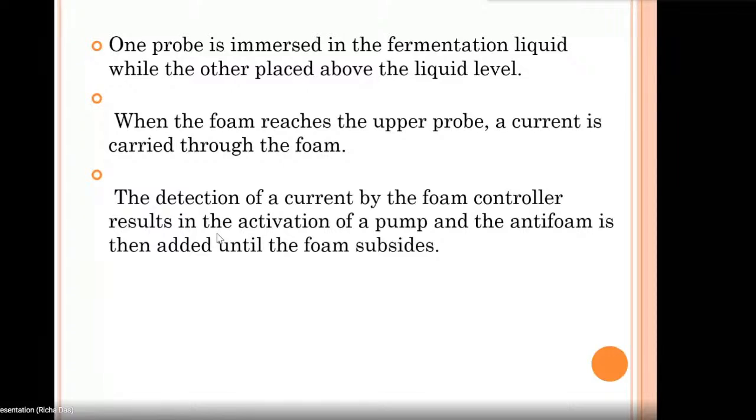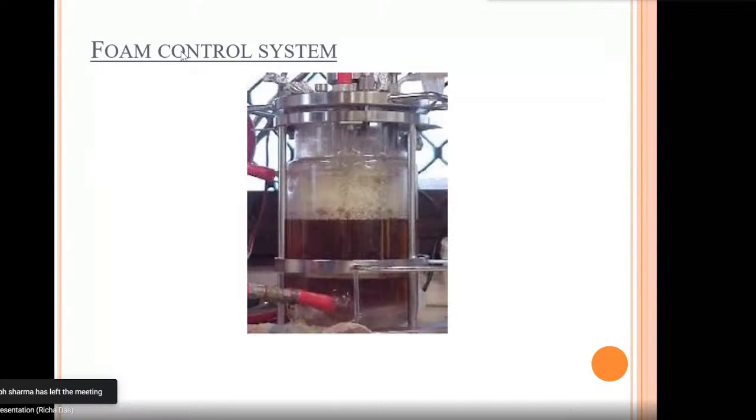Now, as I said, nowadays we use fermenters which are fully automatic. They are fitted with sensors and everything. So here also there are some foaming probes or sensors. Here we can see the word probe. Probe actually means sensor. The other term for probe is sensor. So foaming sensors are also kept. Let me explain the significance of these foam sensors.